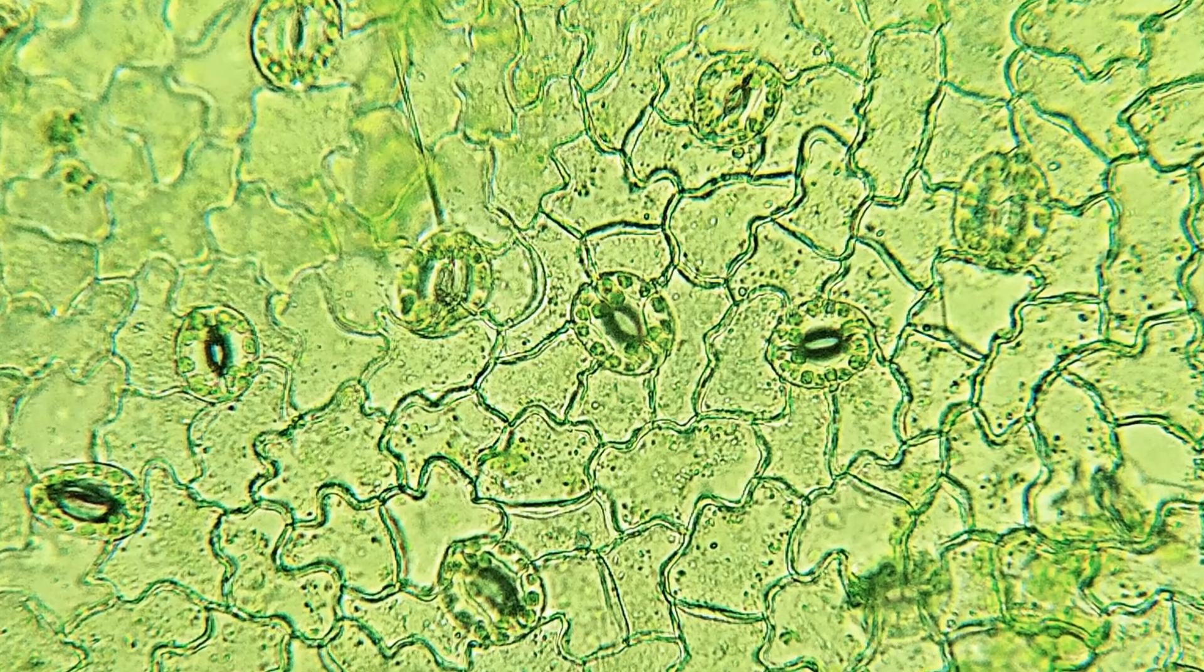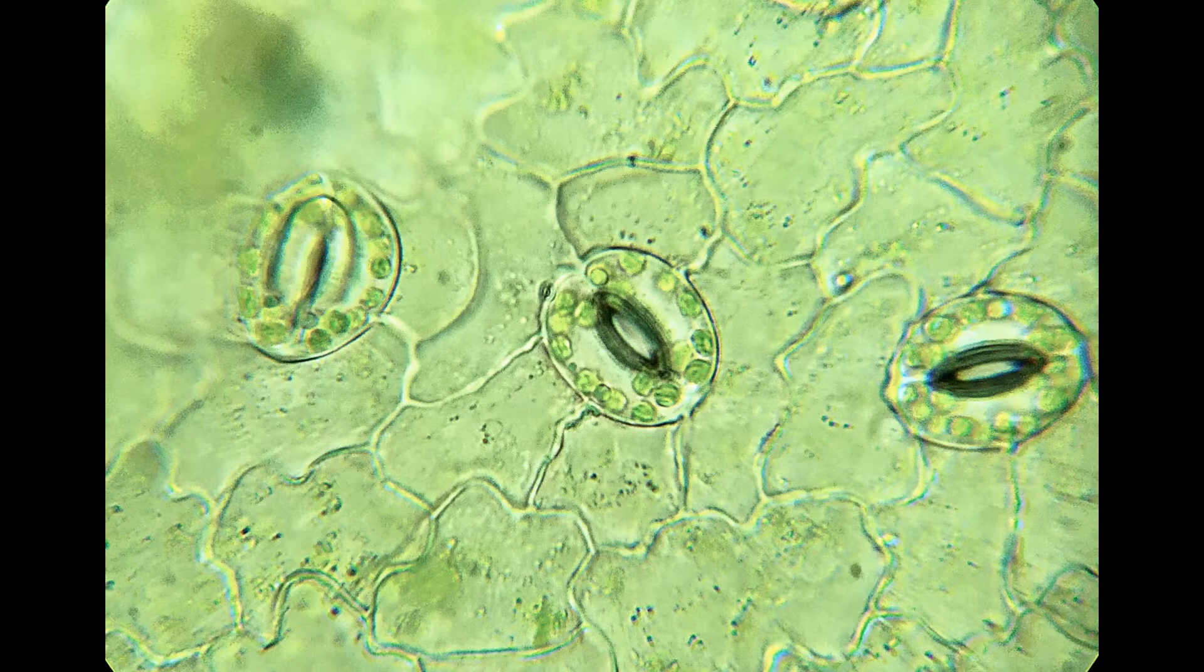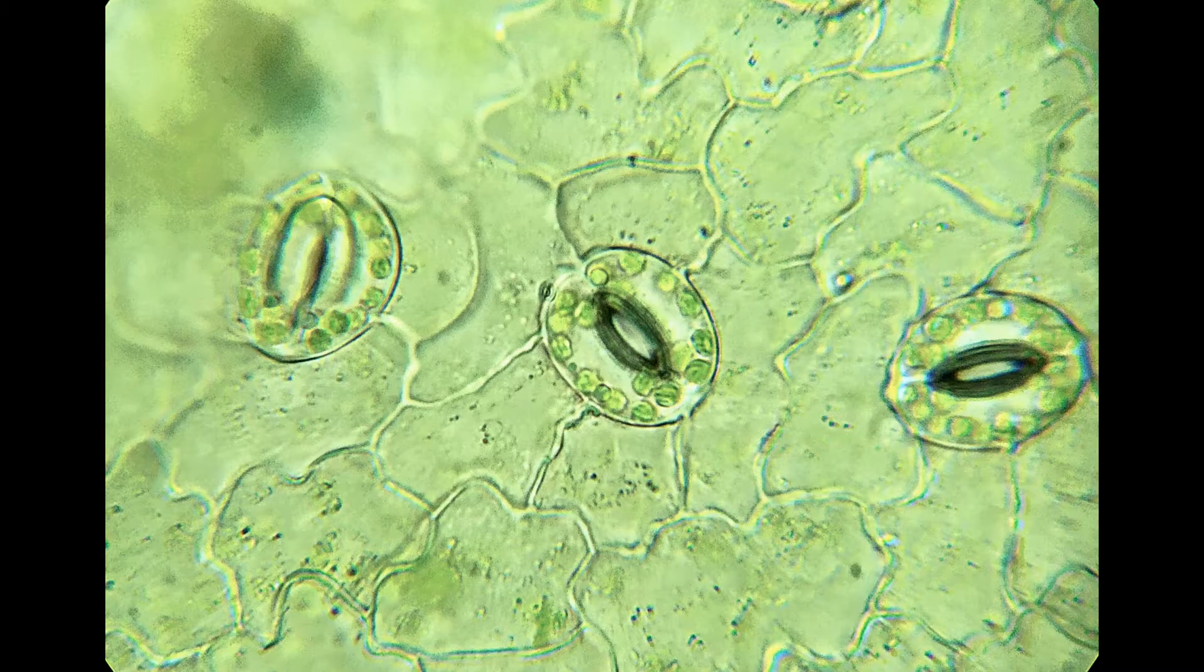Stomatal transpiration accounts for about 50 to 96% of transpiration. A stoma is surrounded by a pair of specialized parenchymatous bean-shaped epidermal cells called the guard cells.